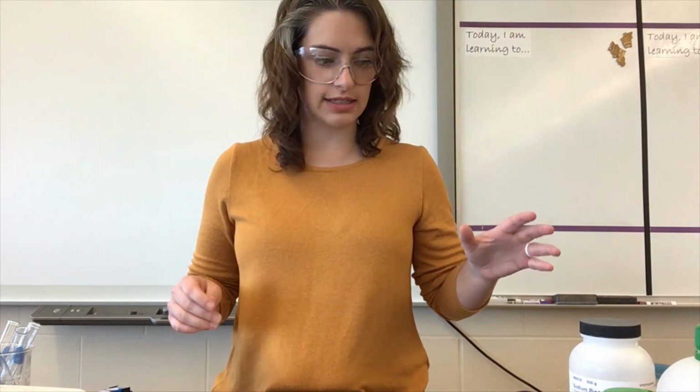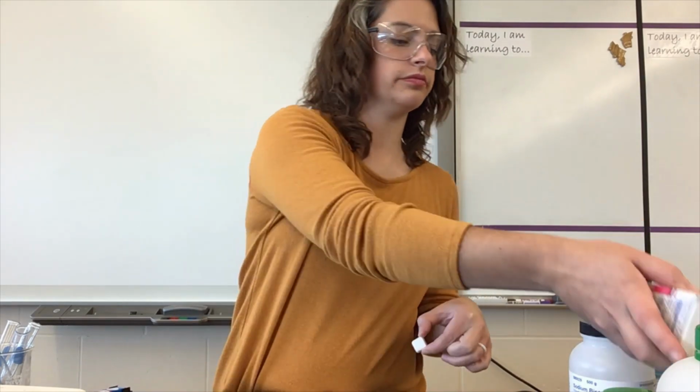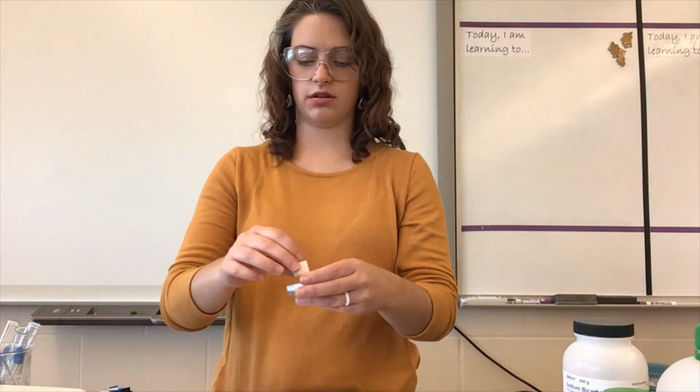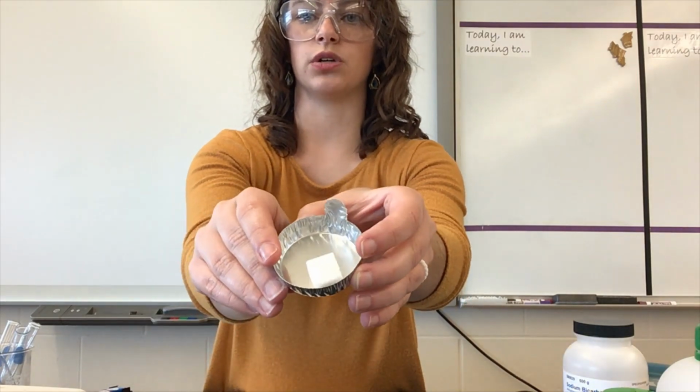Okay, next one is our sucrose. So again, my sucrose is in the form of a sugar cube. Just for consistency, I'll put that in my weigh dish, my aluminum dish. So there you go, there's my sucrose.